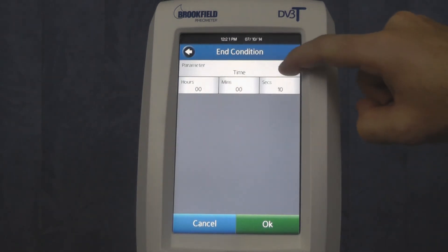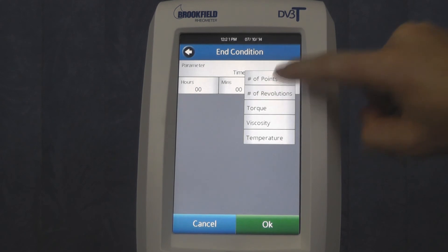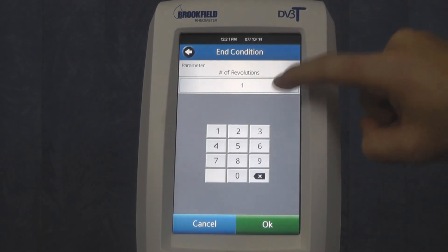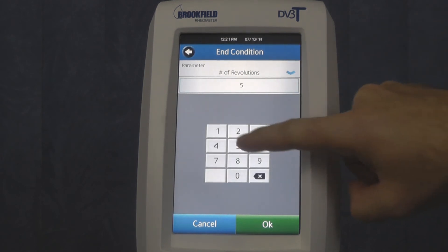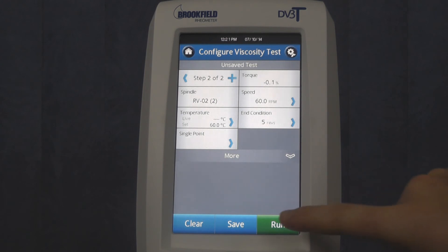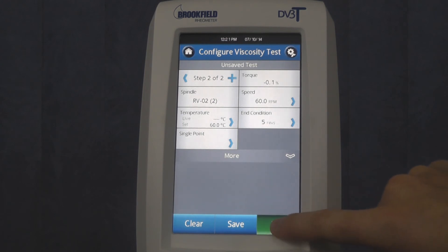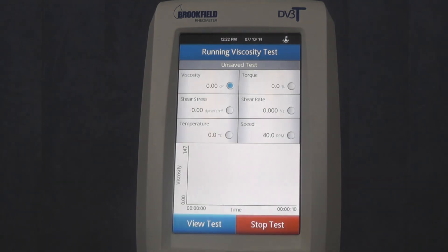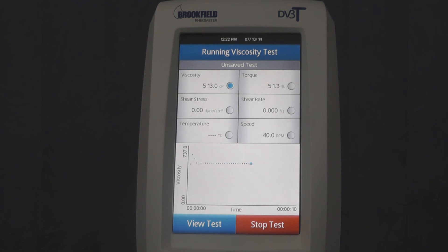Our new DV2T and DV3T units will accept up to 25 steps, each of which could have different speeds. Once the test program is set up, all you have to do is press run, and the instrument will perform all the steps outlined in the step program, including the change of speed.